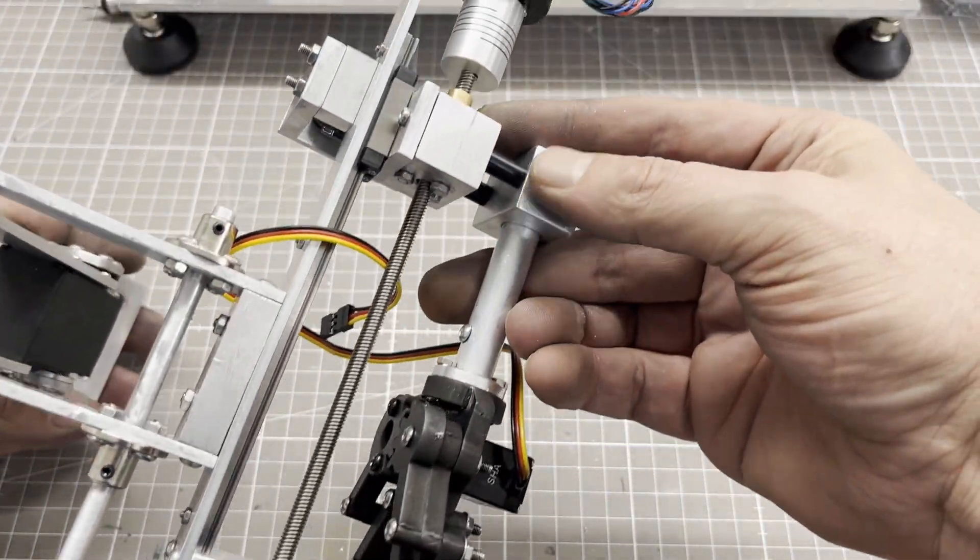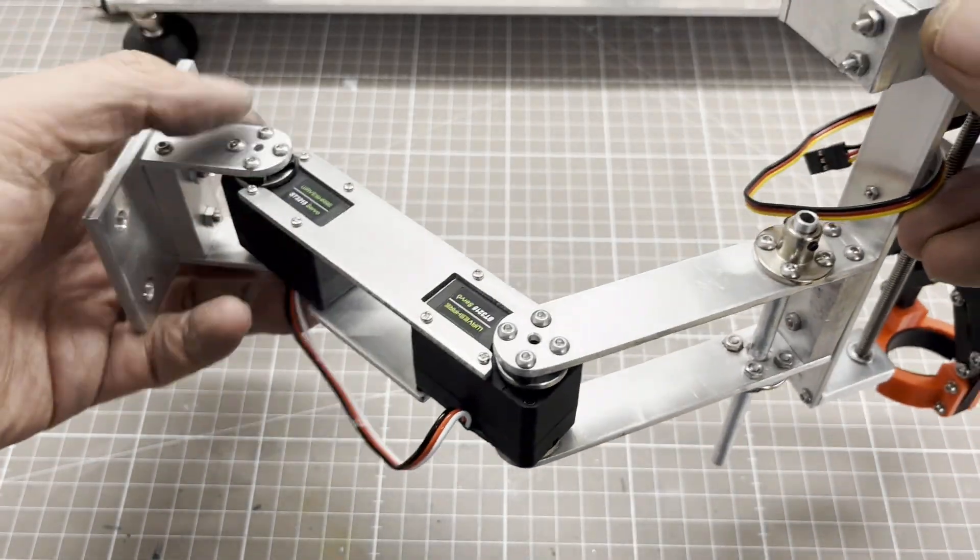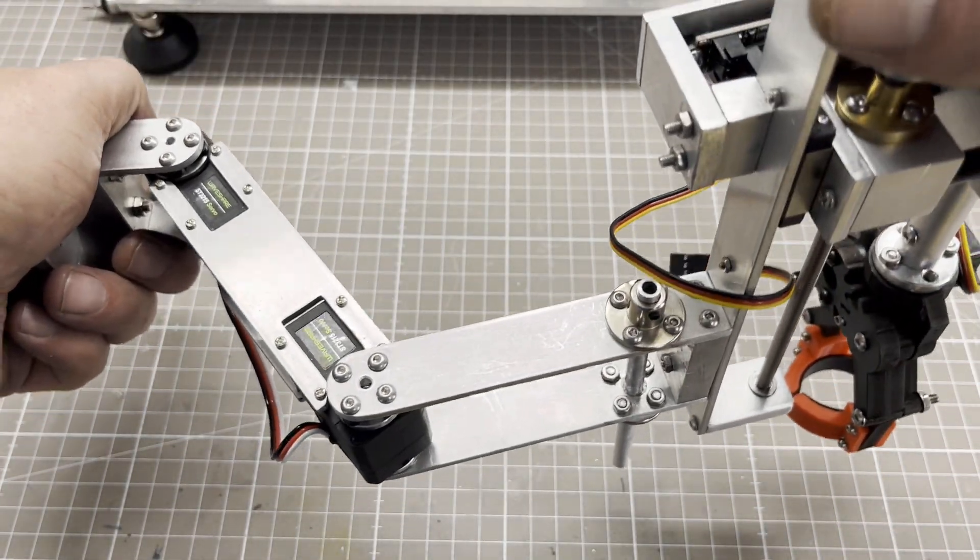That was really a hell of a work. In the second part we will complete the mechanical construction of the autosampler. I hope to see you there again.